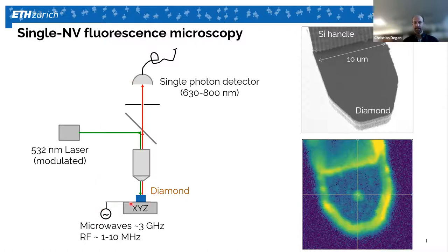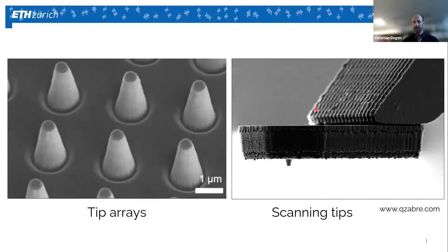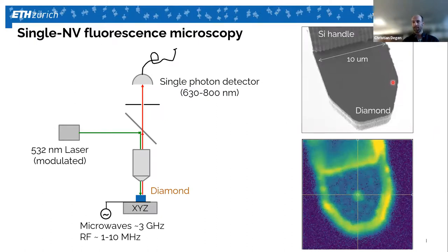So we have a small strip line antenna that is close to the diamond. And if you look at this diamond, and I'm now showing one of those scanning tips looking down from the top, the pillar array looks similar. Then you see the image to the right. The top is just an electron micrograph showing this same paddle that you see here from the top. So the diamond tip is below my red laser pointer here. And below is an optical fluorescence image, and you see this bright spot in the center, which is this pillar, which has an NV center at the end. So for experiments, we park our laser spot at this location, and then we collect photons from the NV center that's on the opposite side of the diamond.